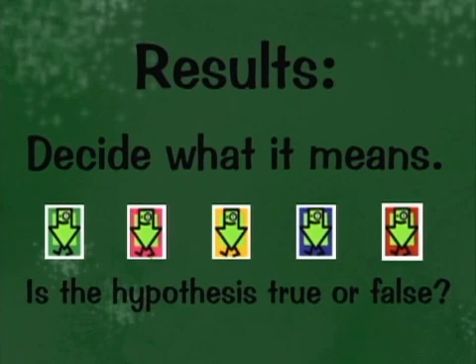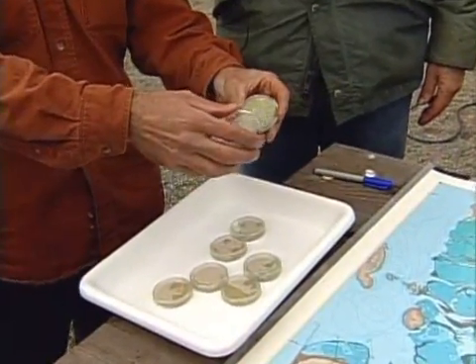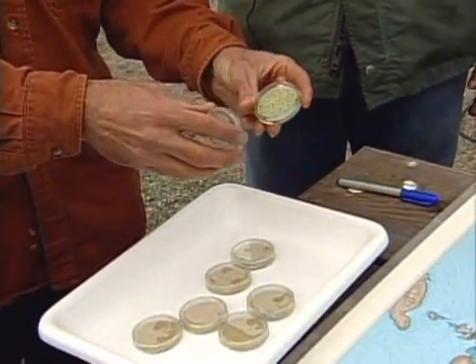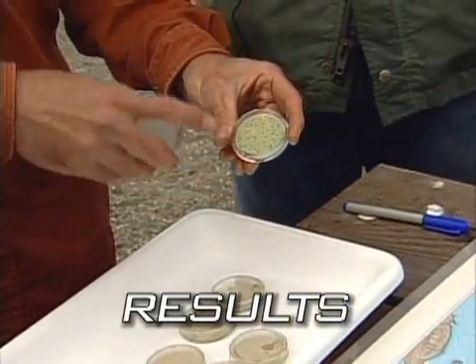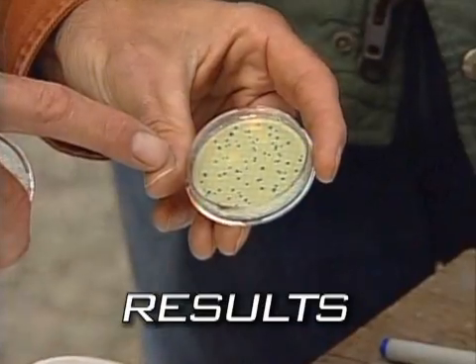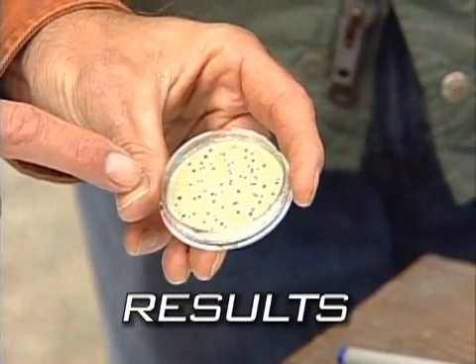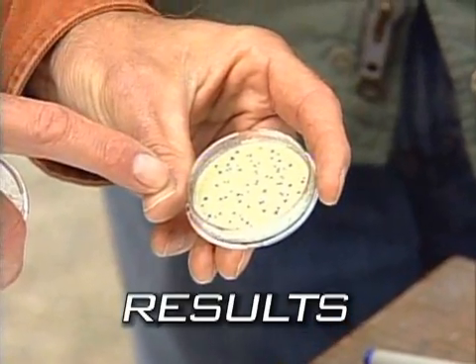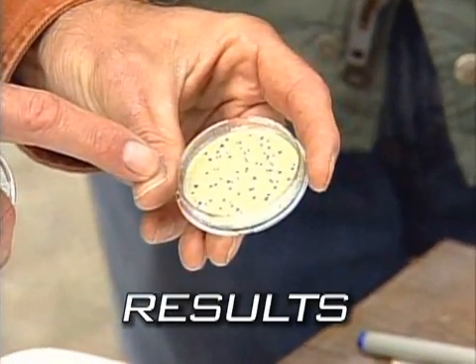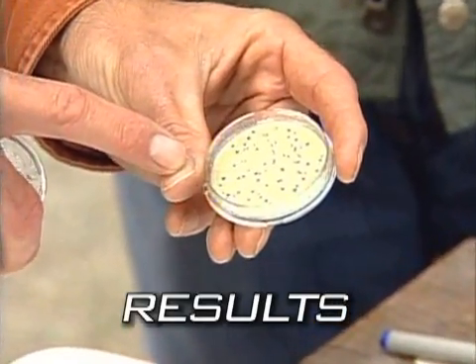I might be able to do that because I don't want everyone touching these. These are E. coli bacteria growing in here, fecal coliforms, and so I don't want people with gum. Whenever we're working around this stuff, we definitely wash our hands a lot and we're really careful with it. But you can see right on this tray where we have about 89, we go in and we count every one of these blue dots, and that's a bacteria that's grown over the past 24 hours. And this sample came from one particular place in the bay out of our 7 places we tested.